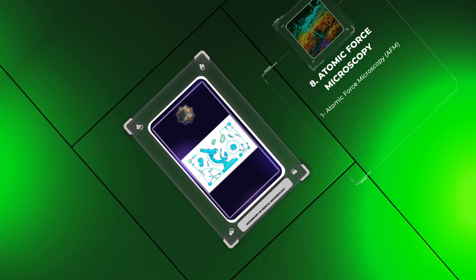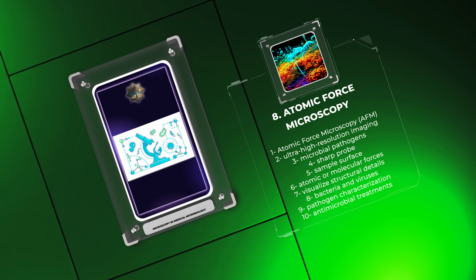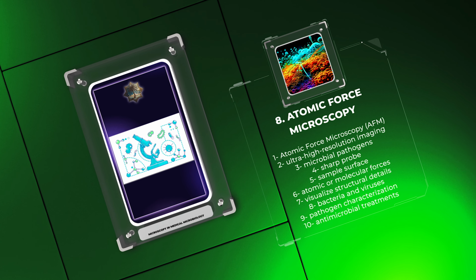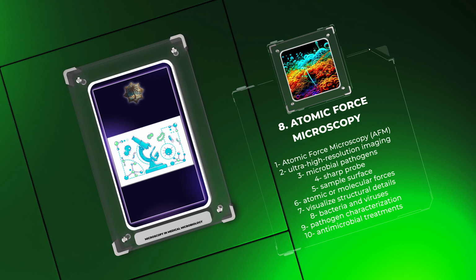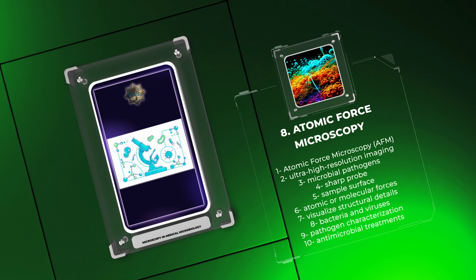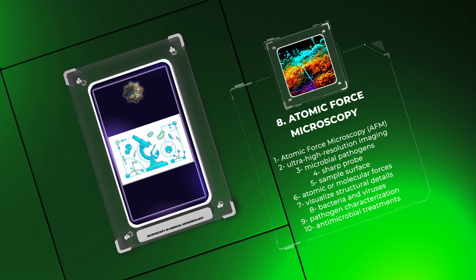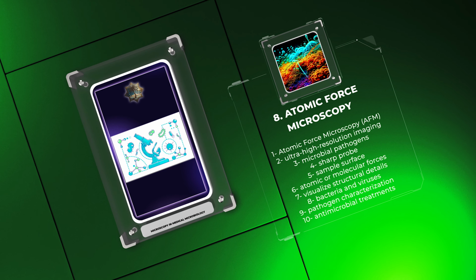Atomic force microscopy, AFM, provides ultra-high resolution imaging of microbial pathogens. This technique uses a sharp probe to scan the sample surface, detecting atomic or molecular forces. AFM can visualize structural details of individual bacteria and viruses, aiding in pathogen characterization and evaluating the impact of antimicrobial treatments.